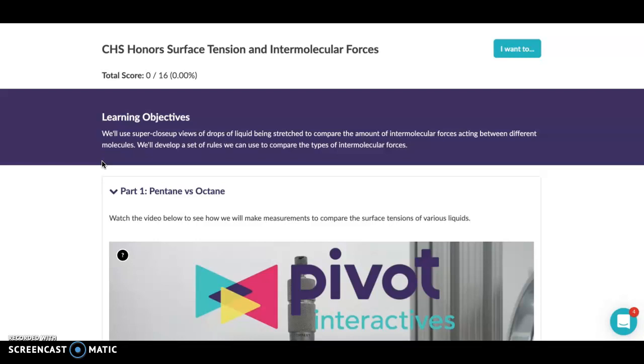That is okay. I understand that you are learning about intermolecular forces, and this lab is a great lab to show you the strength of intermolecular forces using the property of surface tension.